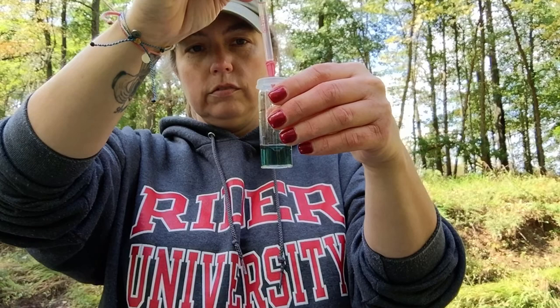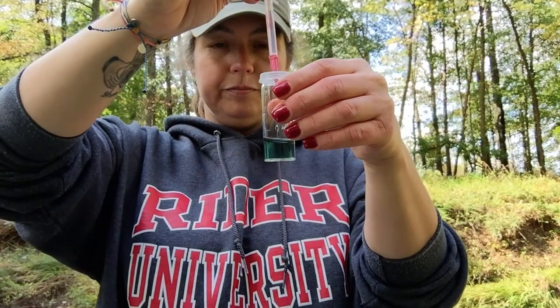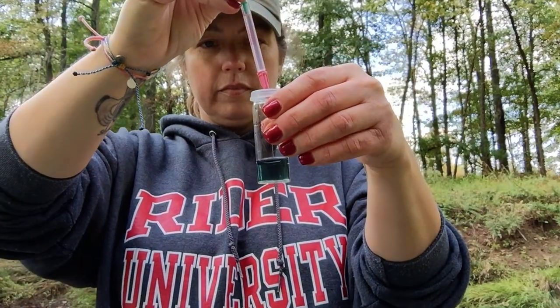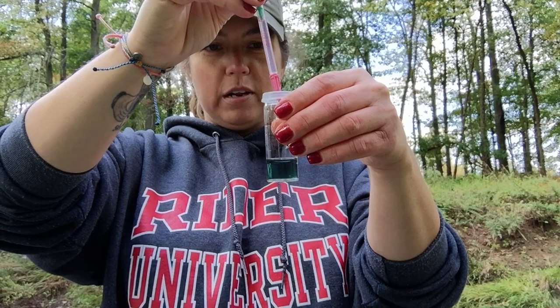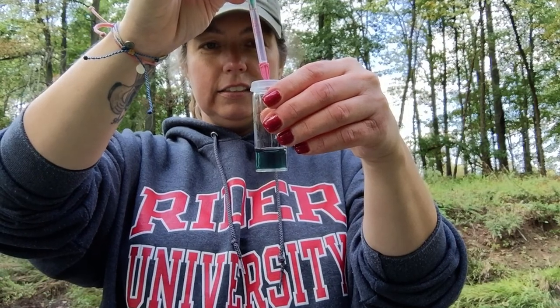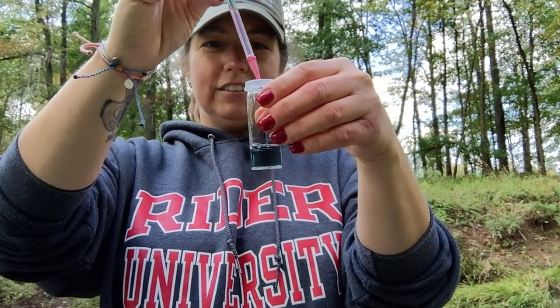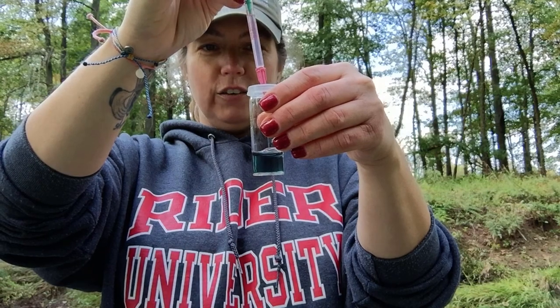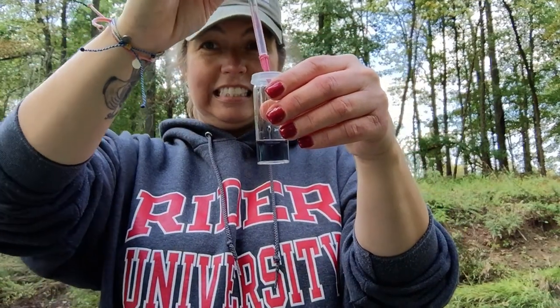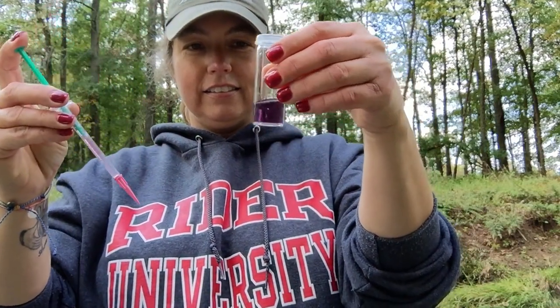I don't want to do two drops at once. Are you guys seeing it flash purple? Part of me wants to do two but I'm totally not doing two. I'm doing one more.